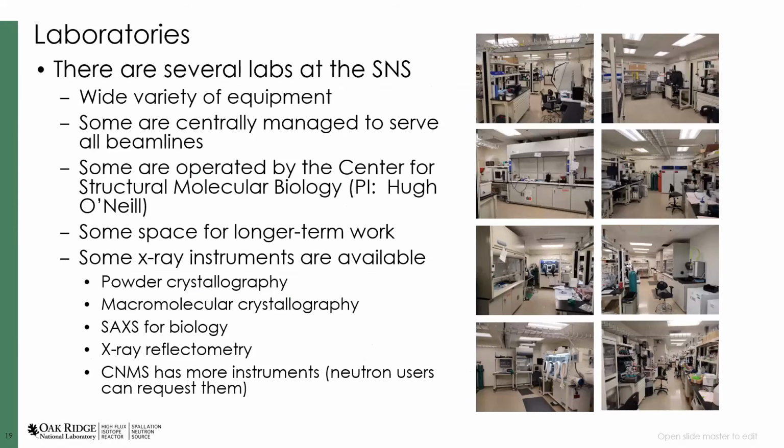So I also want to bring to everybody's attention the laboratories that are available at SNS and HFIR. So the SNS actually has a fairly comprehensive laboratory space that's available to users. Quite a few of them are centrally managed again, and we serve all the beamlines with them. We have considerable amount of equipment that's available for characterizing your samples, for preparing your samples. As I mentioned, the Center for Structural and Molecular Biology operates the biodeuteration laboratory that also includes materials characterization laboratories that go along with the rest of their effort. So spectroscopies, optical and IR, et cetera, those are available.